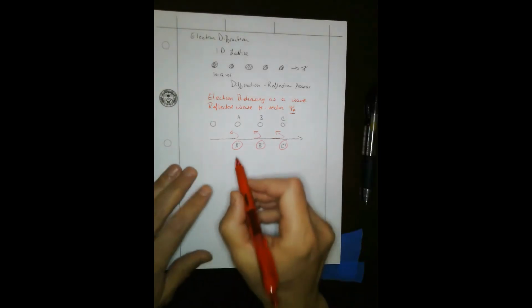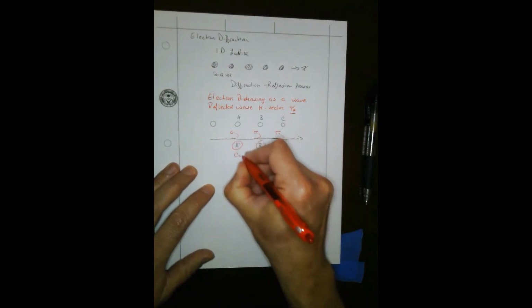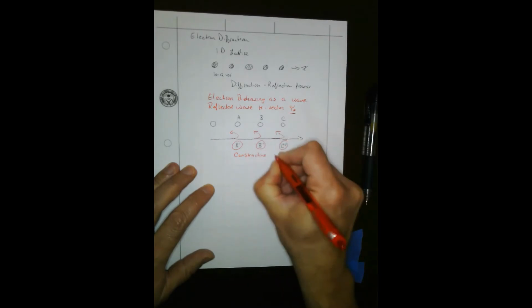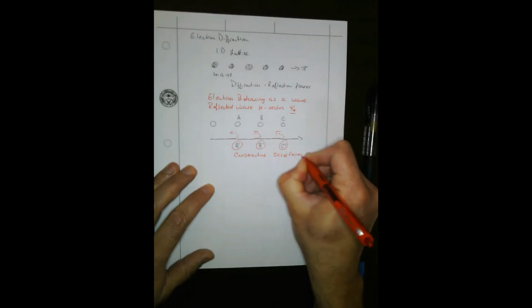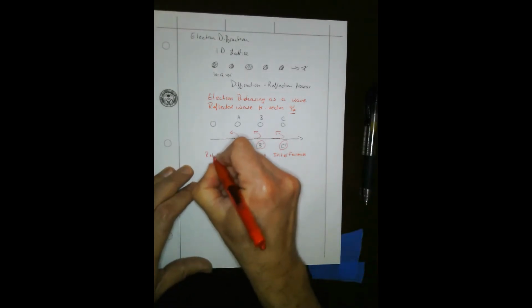We always talk about path difference, okay? And so when we have these reflections, we're getting constructive interference.